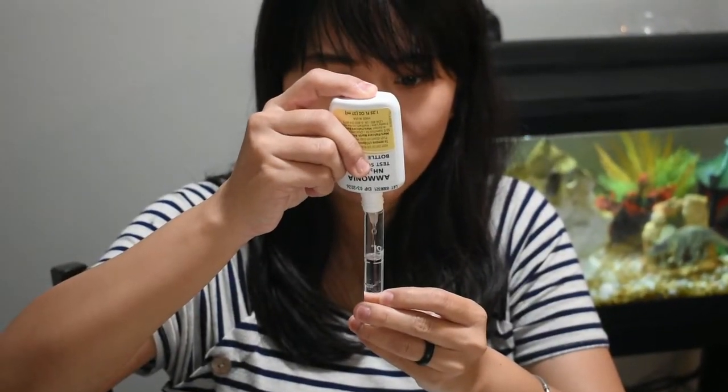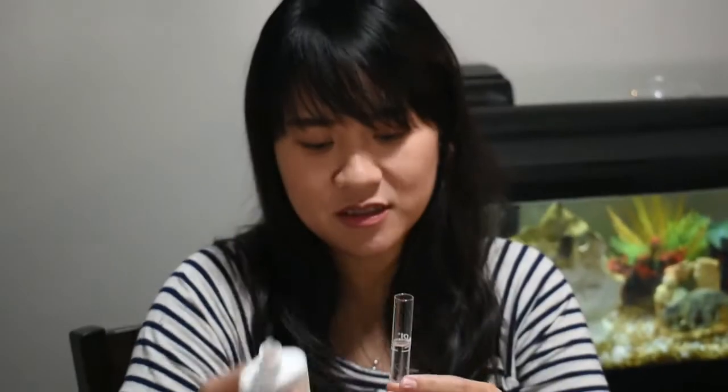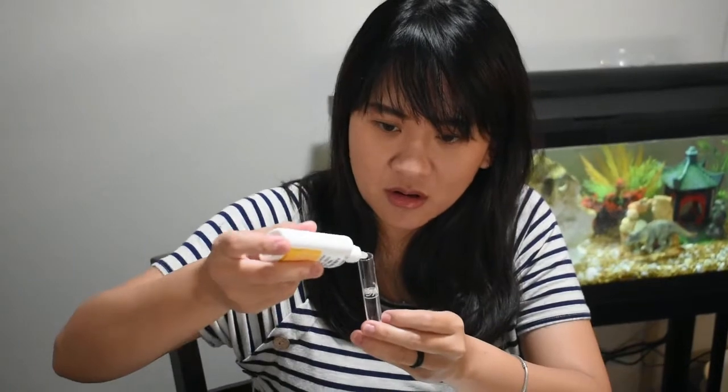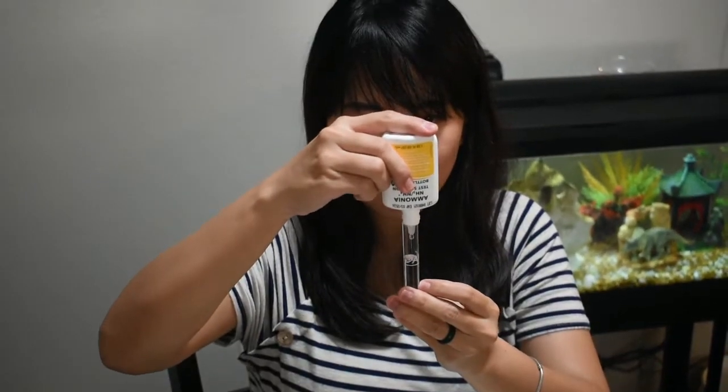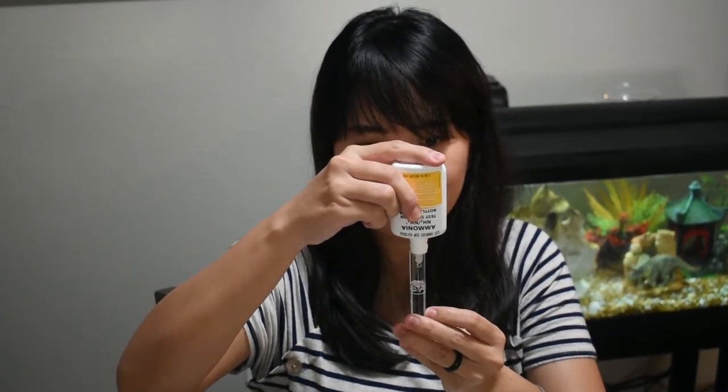That's it. And the next one, we add bottle 2, and we will drop 8 drops in here. Again like this. That's it. And we put the caps like that, and we need to shake this for 5 seconds.